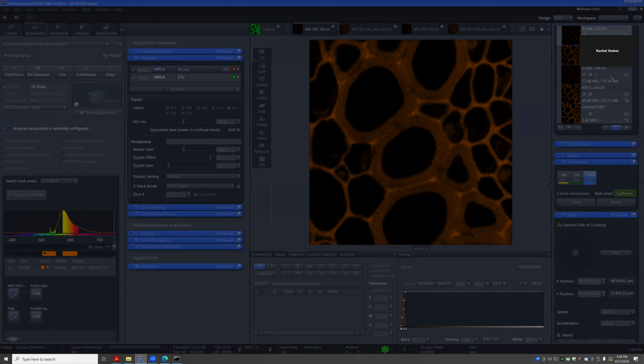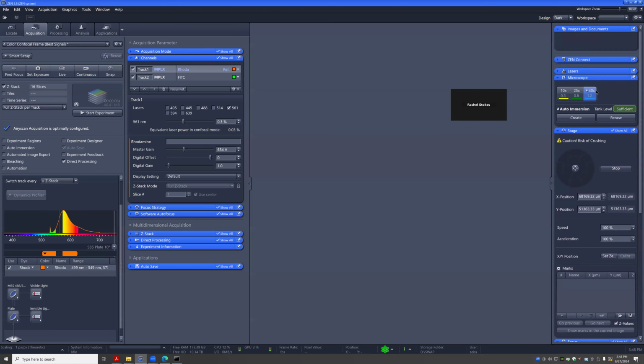I mean, you can also, like here, oh, I got rid of it now. So if you see the images here on the right side, then they'll be listed here. I don't really do that, but you can give them ratings, like, oh, this is a 5-star image. It's good for coming back to something later. If you open 10 images and you're like, which one was a really nice one, that'll be marked. Pretty convenient.